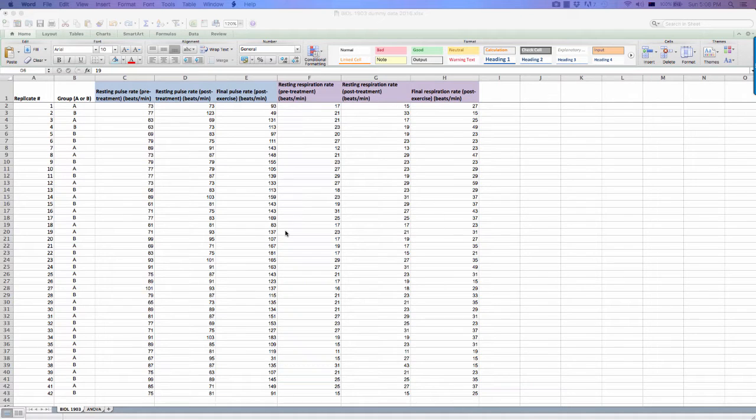Hello, it's Hong here. If you are in Human Biology Advanced, this video will guide you through the process of analysing the raw data collected from the caffeine experiment in Practical 2. I have some dummy data here, and the spreadsheet you would have downloaded from Blackboard is structured in the same way, so you can work through your data as I do the same with this dummy data set.